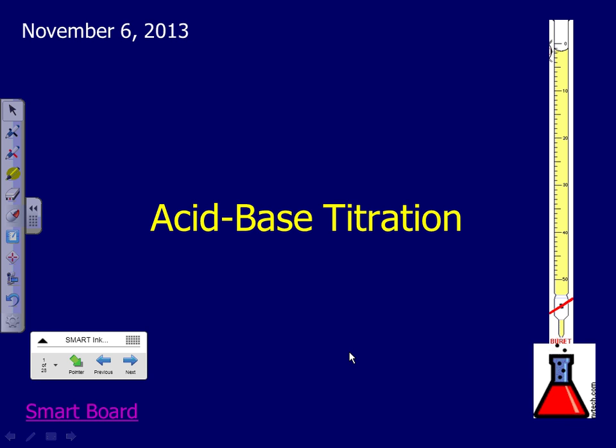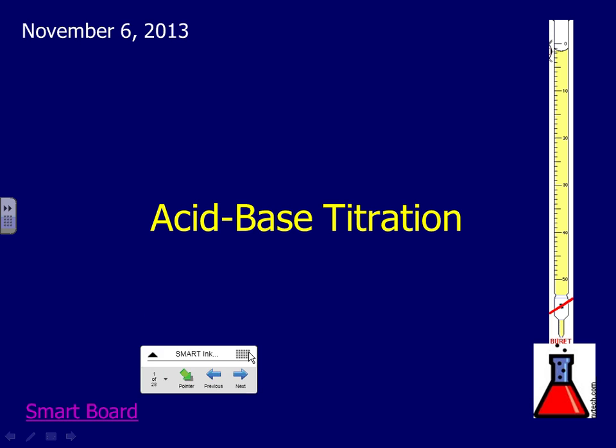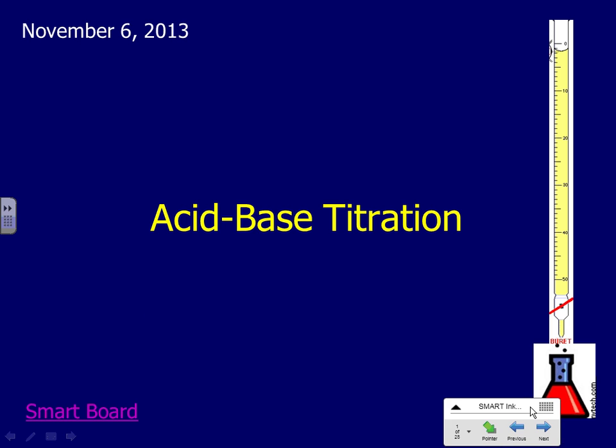Okay, in today's lesson, we're going to be looking again at acid-base titrations. We've already looked at acid-base titrations in grade 11, and we're going to need those skills that we learned in grade 11 in order to study acid-base titrations here in grade 12. But then once we've reminded ourselves of those skills, we will use them to analyze a titration in more detail than in grade 11. In grade 11, we were only worried about when the color change took place.